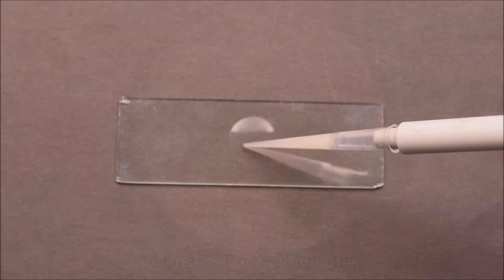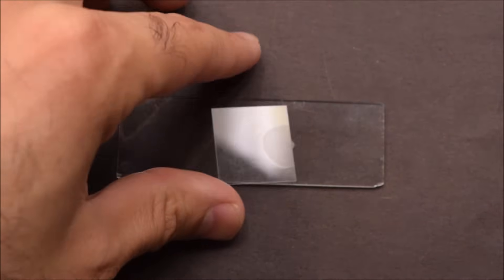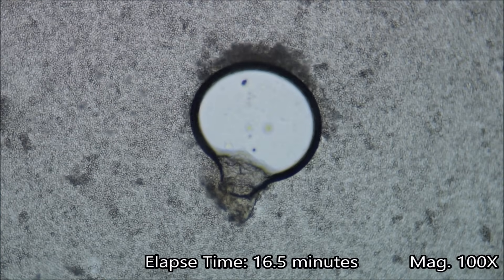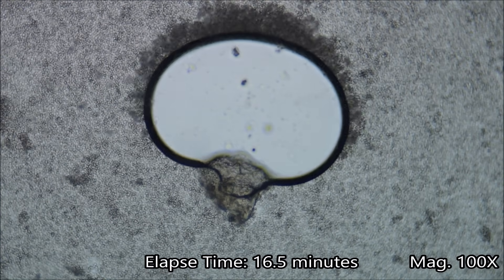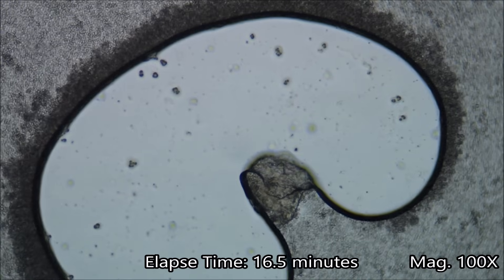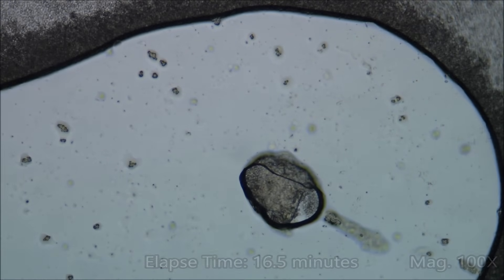We can see this happen at the microscopic level as well. If we put yeast, sugar and warm water on a slide, we can see these bubbles growing under the microscope when the video is sped up. We can see tiny bubbles forming around thousands of yeast cells. The yeast look like sand when viewed at lower magnifications.